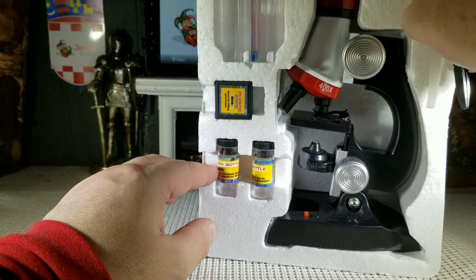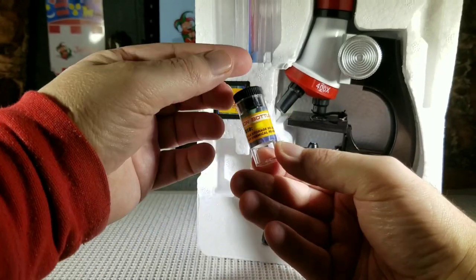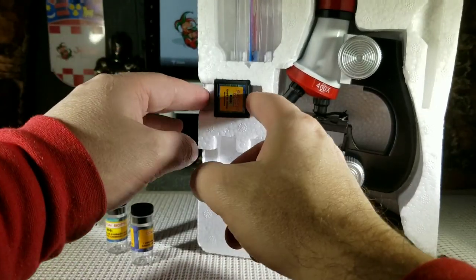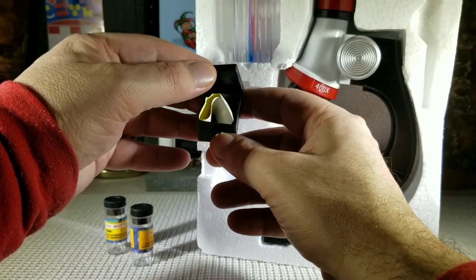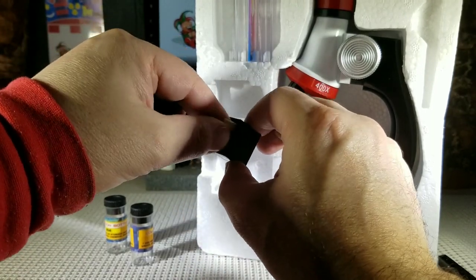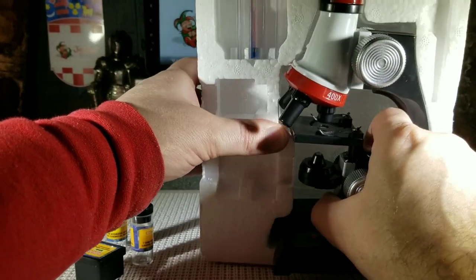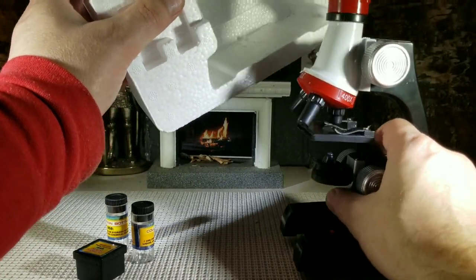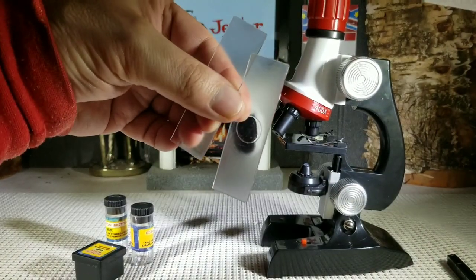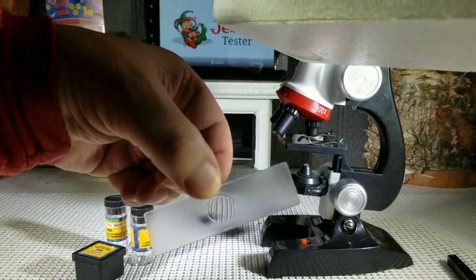In the box you get a set of tweezers — specimen tweezers. You get specimen bottles that you can put little specimens in, like ants or bugs or anything like that. You get a little box with stickers, so when you take a specimen you can put the sticker onto your slides. They give you clear slides — they're plastic, not glass — four plastic slides in the set.